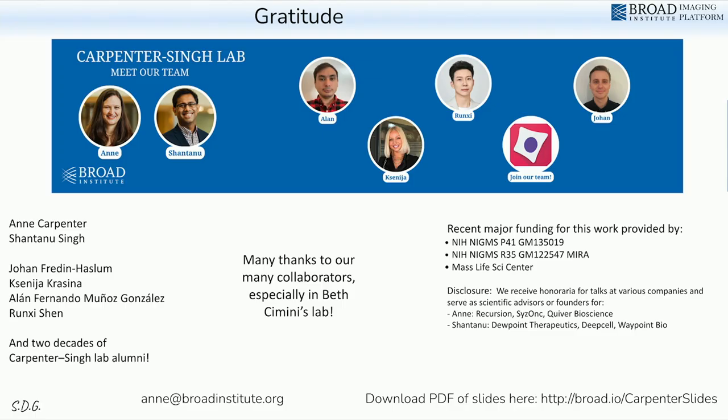You've hit on one of the more exciting things. Recursion has announced publicly that they are shifting towards bright field readouts because they can get a lot of the same information from just a bright field as compared to the dye-based assay. Cell painting's super cheap, but it's not zero to buy the dyes. So that's a big advancement that they've announced.